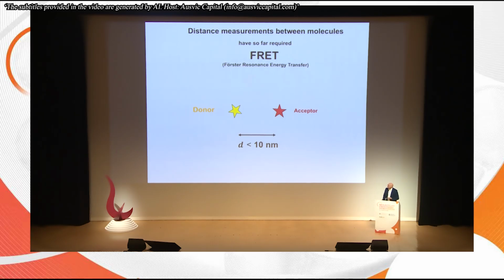Now, this dipole-dipole interaction, which is heavily used in many, many biophysical applications, has a big caveat. The caveat is, again, the orientation, because the distance that you infer from the efficiency of this energy transfer depends on the orientation of the molecules. So if they are oriented unfavorably, then the distance may appear large, although it is not. So it's kind of inaccurate.